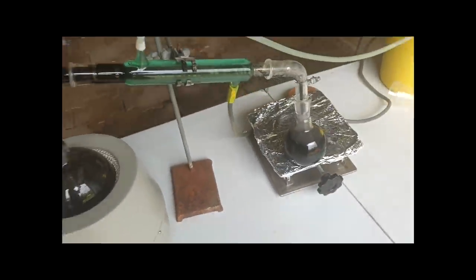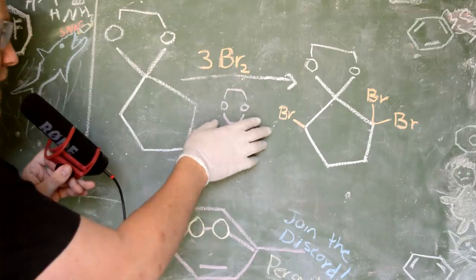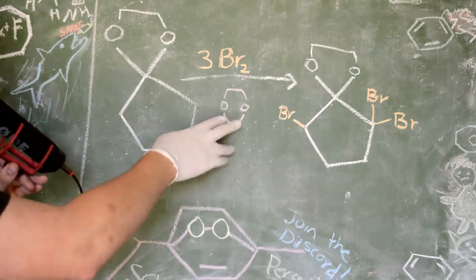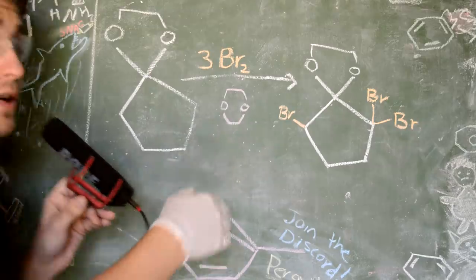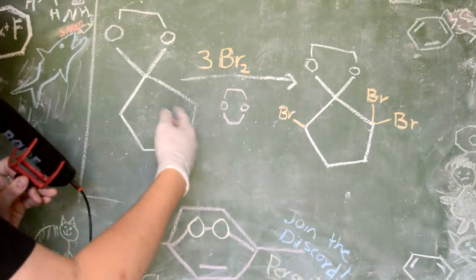Oh, fuck. How do I keep letting this happen? It can be made from ethylene glycol, which is a very available chemical. So it seems like a modification that I've made to this procedure, but no, according to this 1989 research paper, they really tried to use a lot of different solvents other than dioxane, and dioxane was the only one that worked. So dioxane is actually necessary for this reaction to happen.